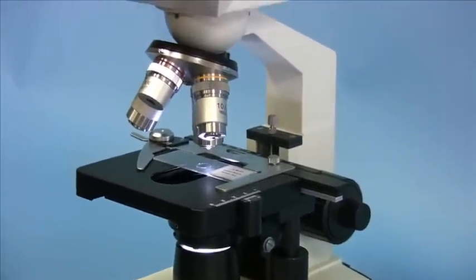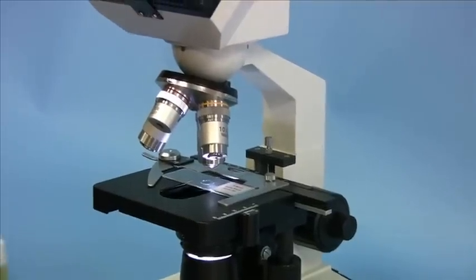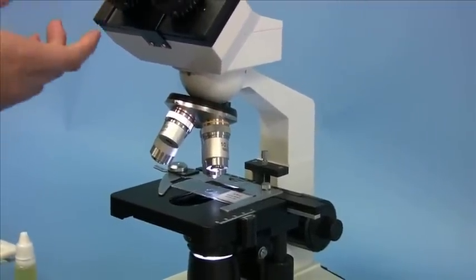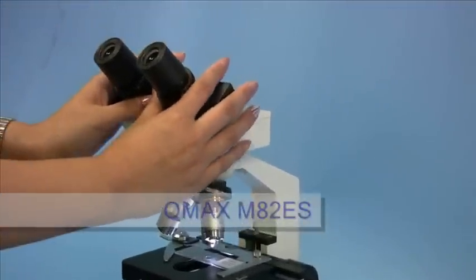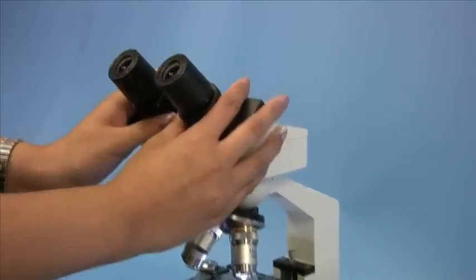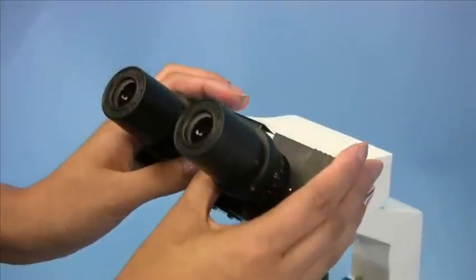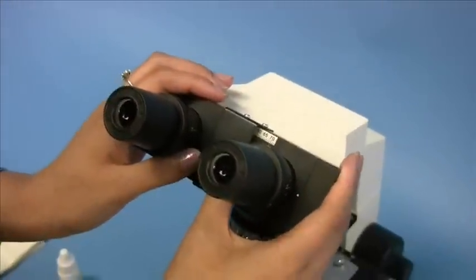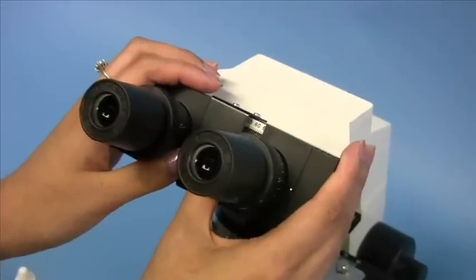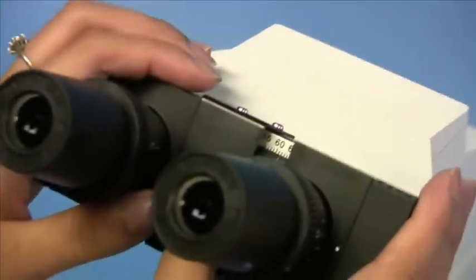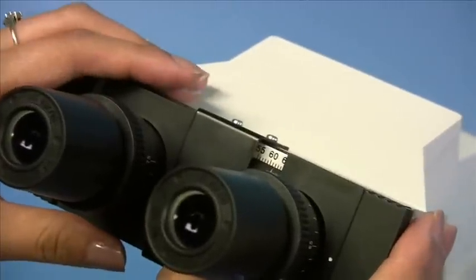Now you want to adjust the interpupillary distance. While observing through the eyepieces, hold both eyepiece tubes and slide in and out. When the distance is correct, the left and right field of view should converge to a single one. That is, you'll see a single image instead of two.